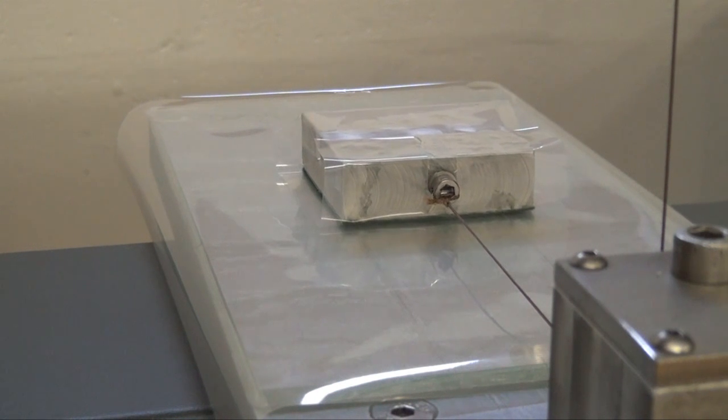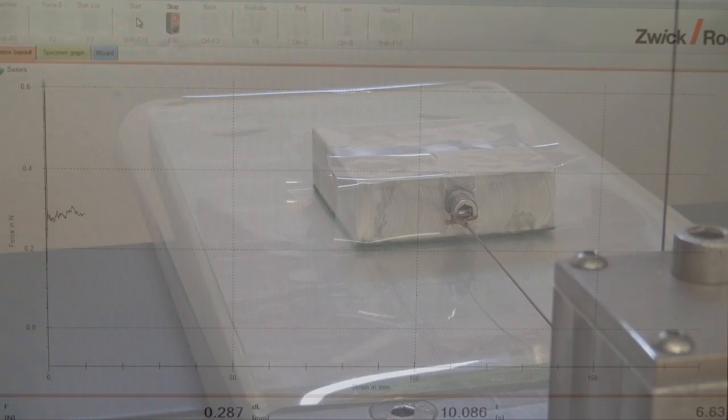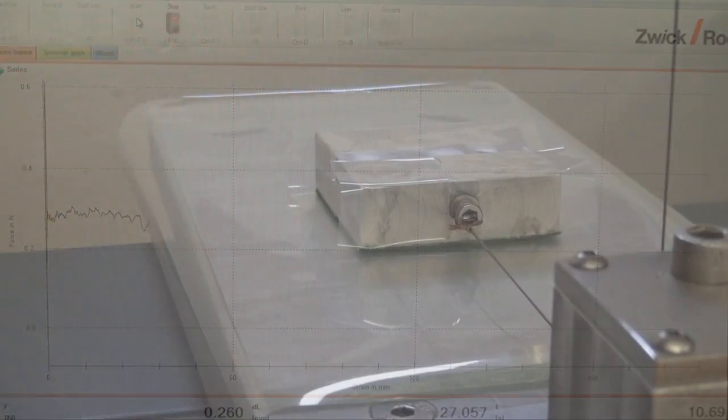The sled moves along the testbed at a fixed speed or for a fixed distance according to the test standard used. The equipment can accurately detect very low frictional forces.